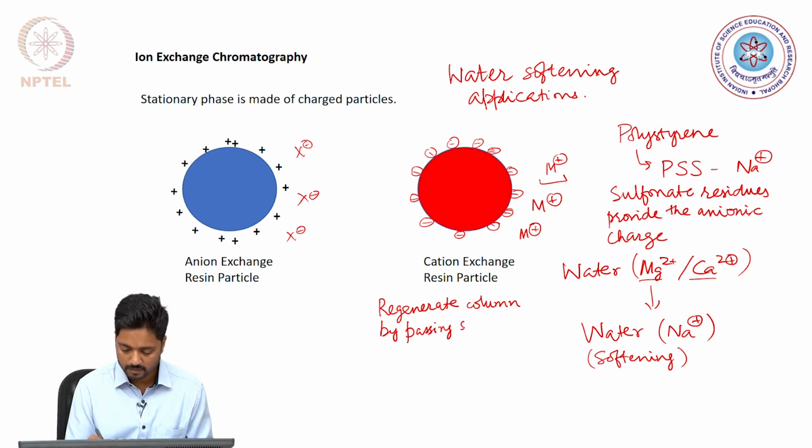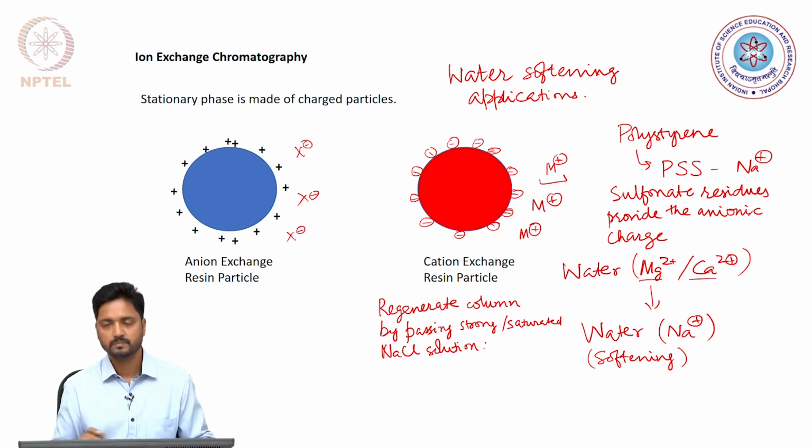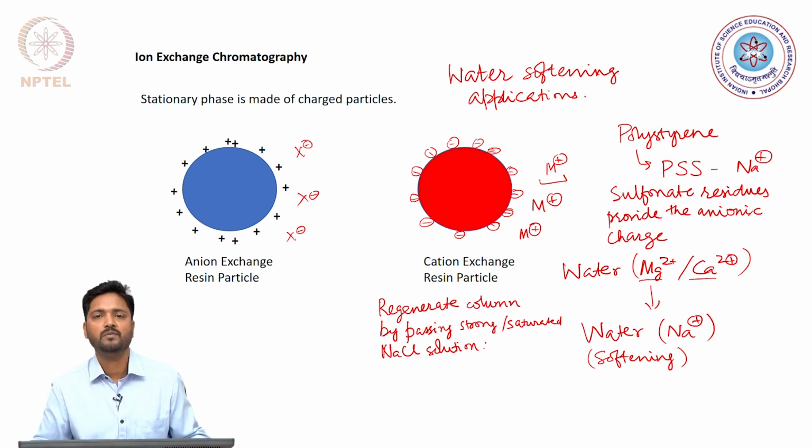a strong or saturated sodium chloride solution through the column. So, this becomes a very convenient protocol for softening water.